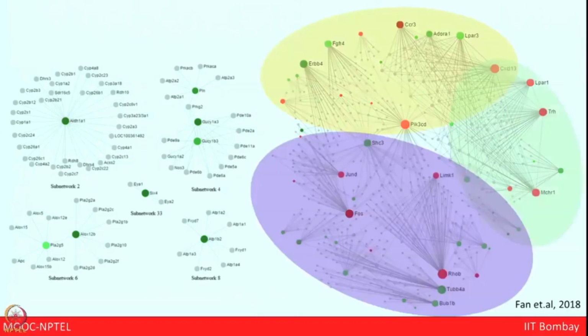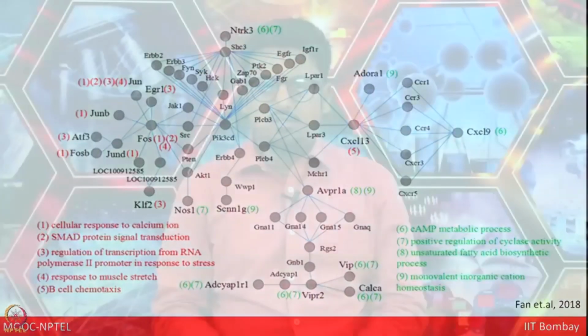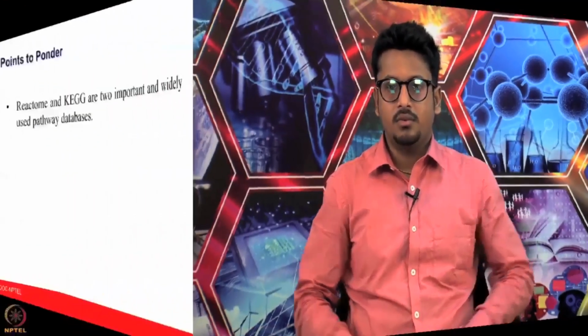Now if I want to check what different clusters are coming in my protein-protein interaction module in terms of pathway, that can also be done by checking the curated sorted Reactome list that we have generated. Apart from this, they have given a complete view of what proteins are present and whether a single candidate is present in multiple pathways or a single pathway with the help of this diagram. So, that is all. Thank you.